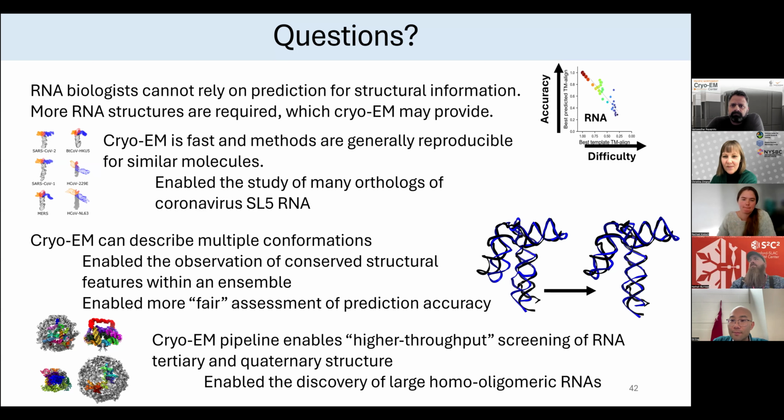The next question is, is the cage of gold known to occur in vivo? Unknown as of now. All of this work was done in vitro. We did confirm that at concentrations that it would be in the cell, it would form. We did some mass photometry and dynamic light scattering at concentrations comparable to cell expression, and it does form. But obviously the cell is much more complex than just a low concentration.